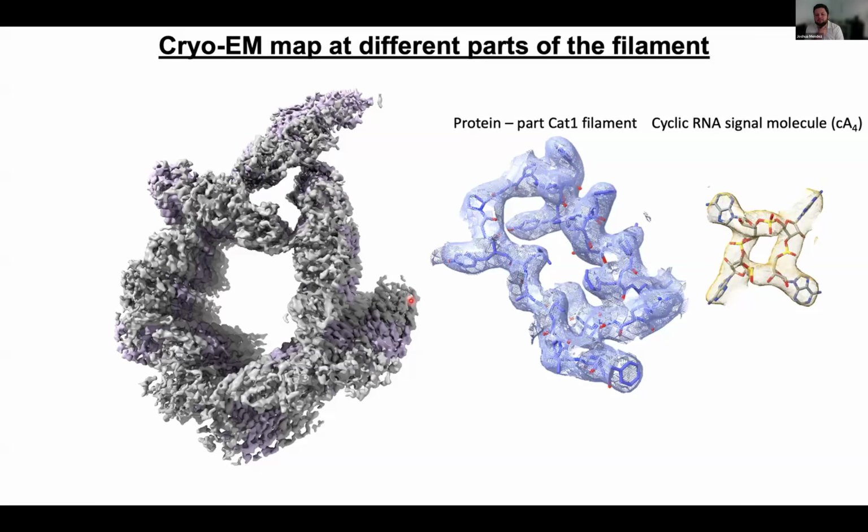So yeah, actually, what I haven't mentioned here is that if I tried to discard or select particles based on the 2D classes, I see preferred orientation. But when I use this method for particle cleaning, the hetero refinement method, my preferred orientation problem was solved. That actually helped me a lot with getting all the different views. So with that, I could get a good 3D map.